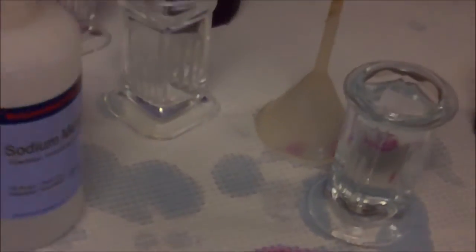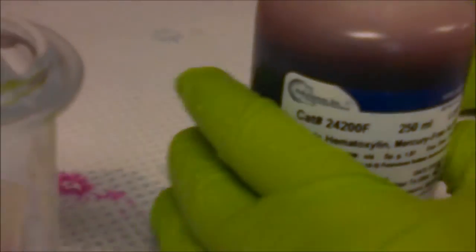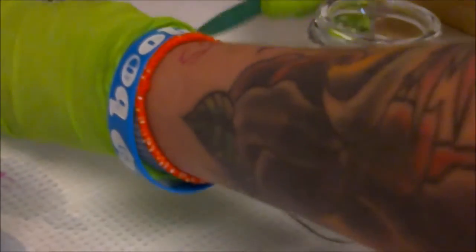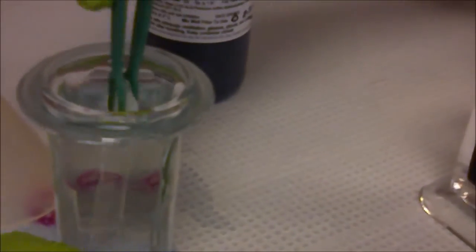After 10 minutes of that, we'll go on to our next step. Take the slide out of the running water. We're going to counter stain for half a minute in the Harris hematoxylin. This is going to be a really quick procedure — half a minute.